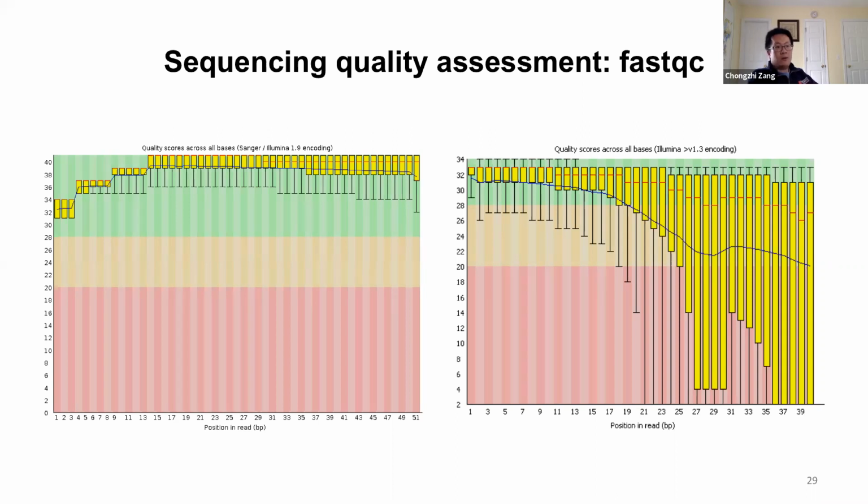So I will probably just ignore these FastQC results and go ahead with whatever we got. But this is usually useful when you have fairly few sequence reads, or only a very small percentage of reads map to the genome.